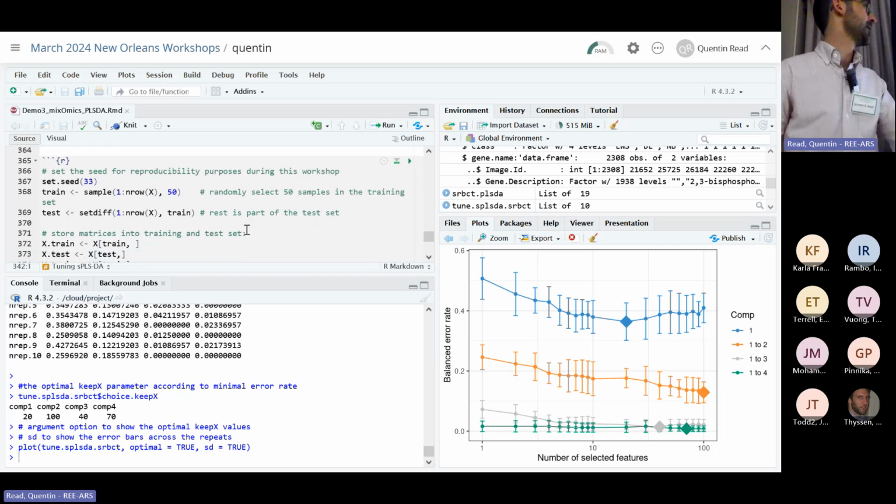We're going to do a little training test split on our data. We got 63 samples. We're going to take 50 of them and refit the model with our best tuning parameters that we determined, on just those 50, keeping our 13 other ones back to predict.